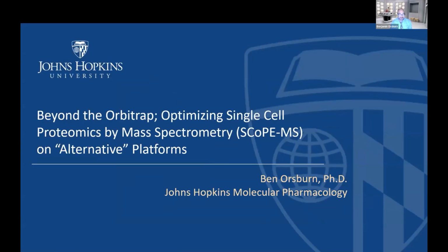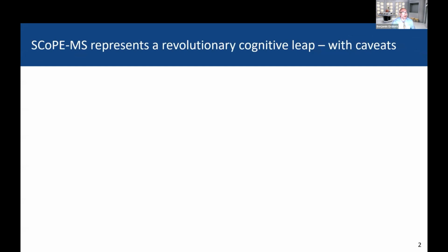And yeah, I'm really excited to talk about setting up SCoPE on alternative platforms. We've talked a lot about SCoPE over this really great meeting, and SCoPE really represents a revolutionary cognitive leap, I think. But you'll learn very quickly to lead with the caveats, right? As you're meeting collaborators, when you start saying things like amplification, they start thinking about PCR, right?